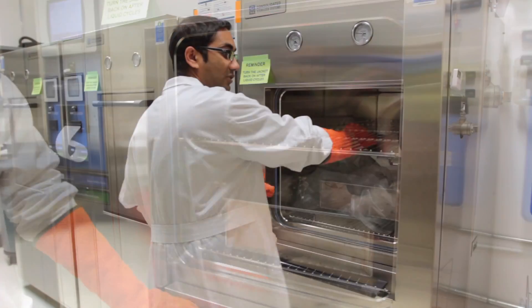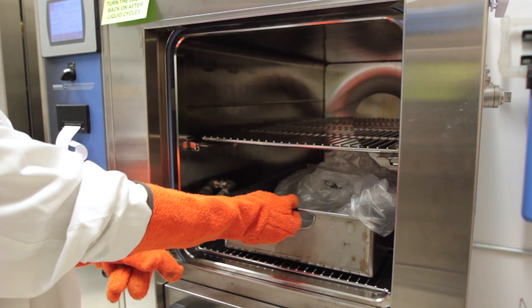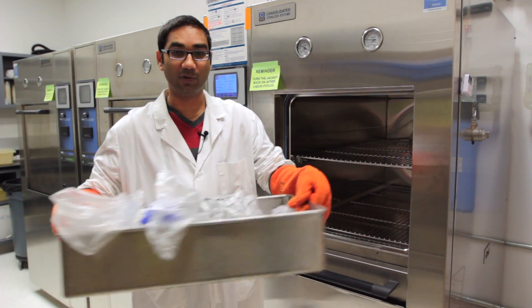Do not reach all the way in because everything inside is hot. Make sure you are pulling things out slowly and carefully. This is already done, so now I can carefully put it away.